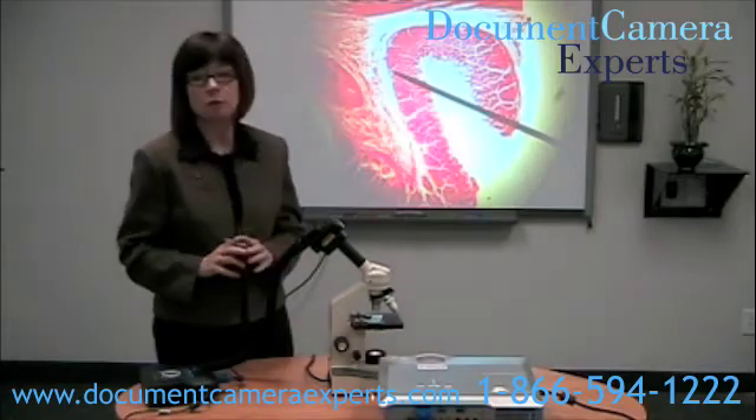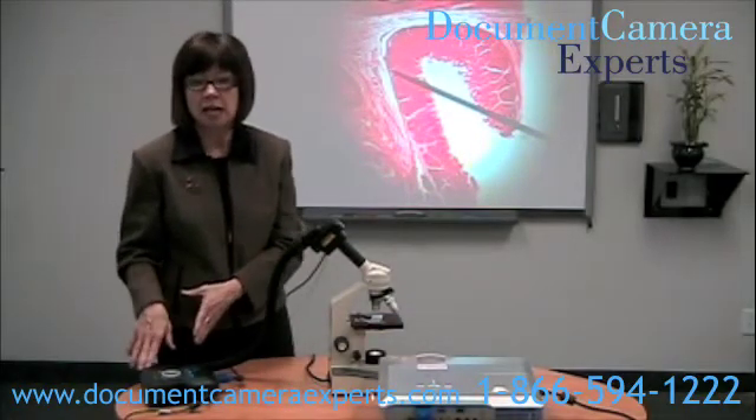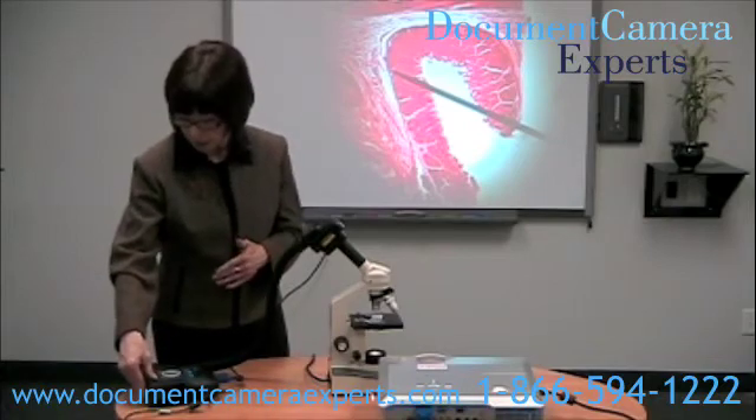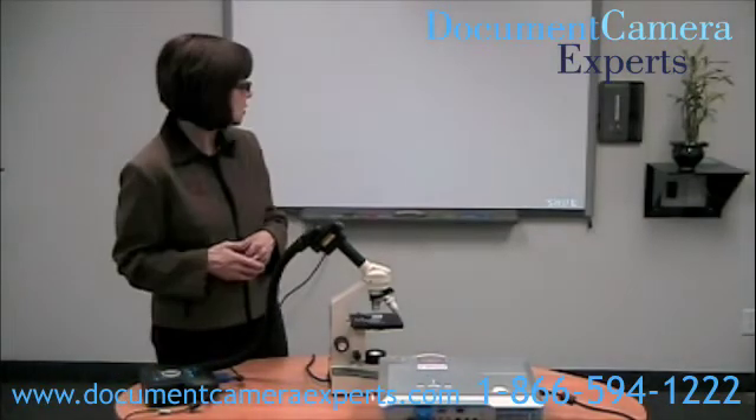There we have a beautiful image, and I wanted to capture that to the AverMedia CP300. So I'm going to press capture delete. And you'll see it's saving.